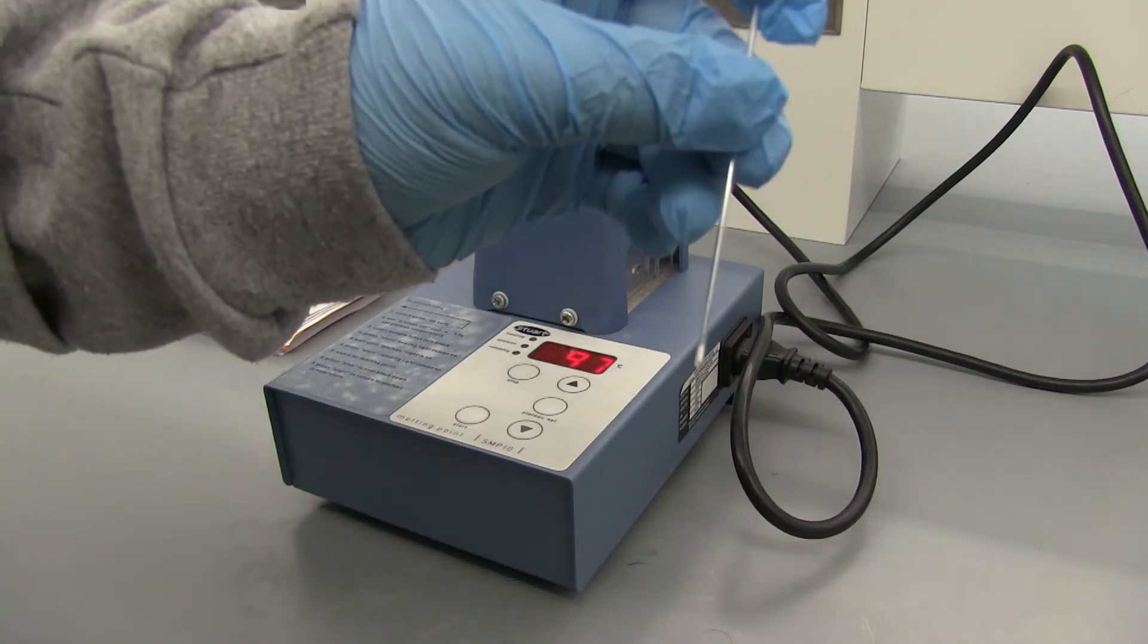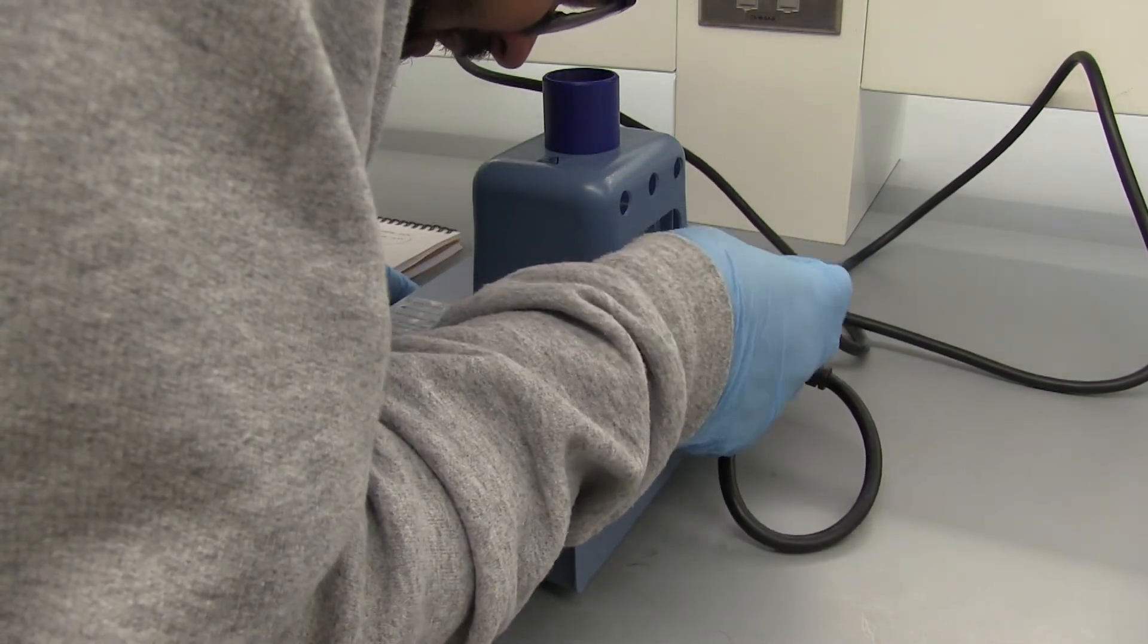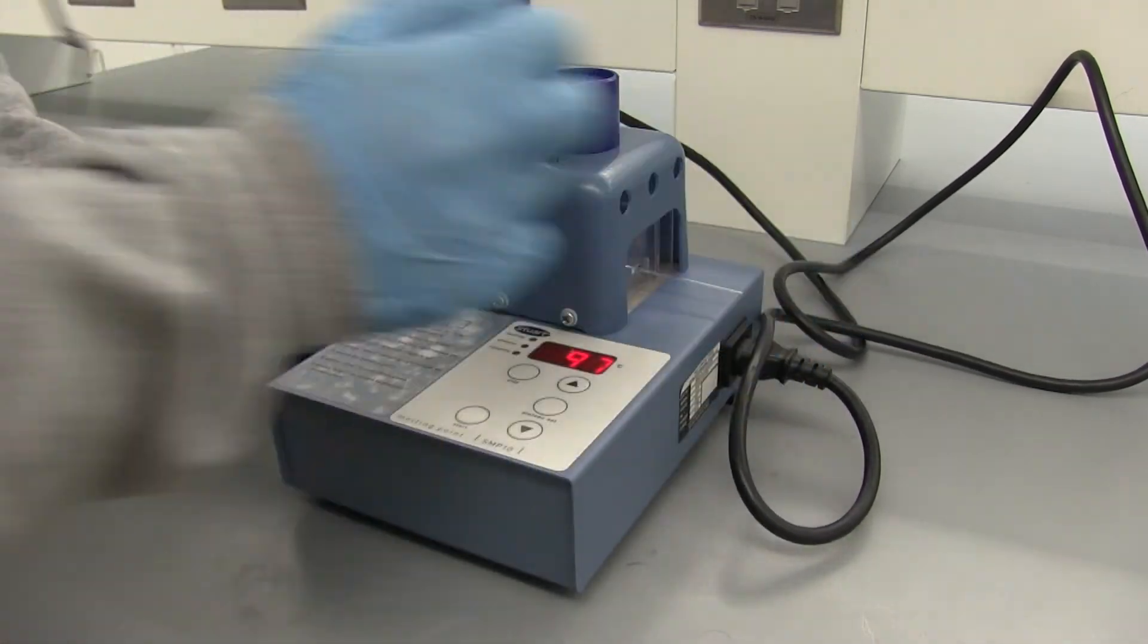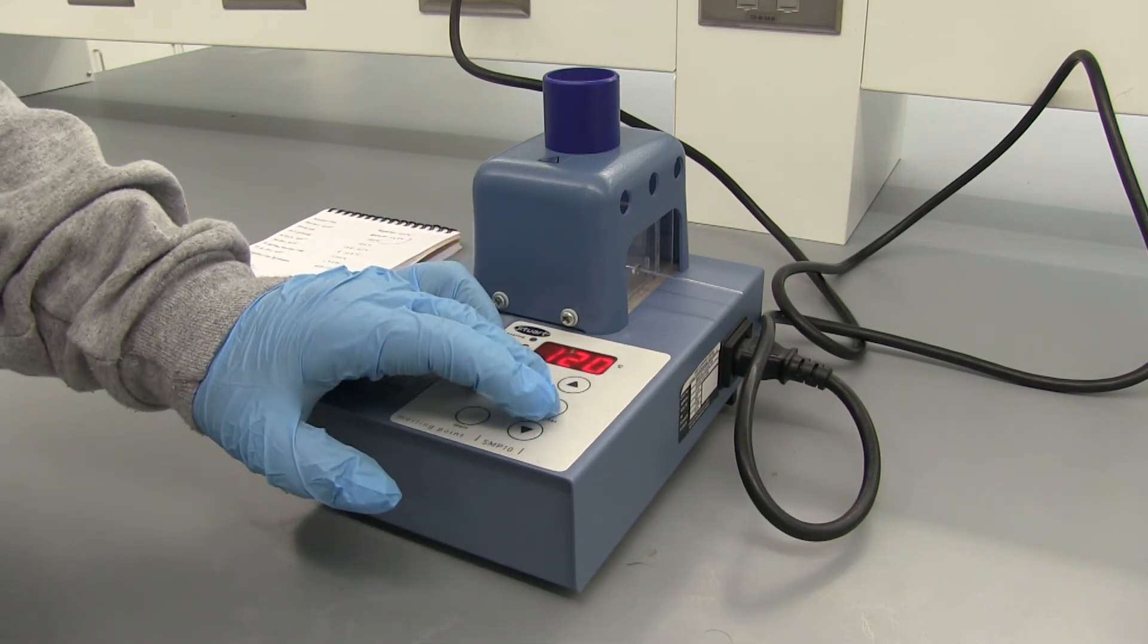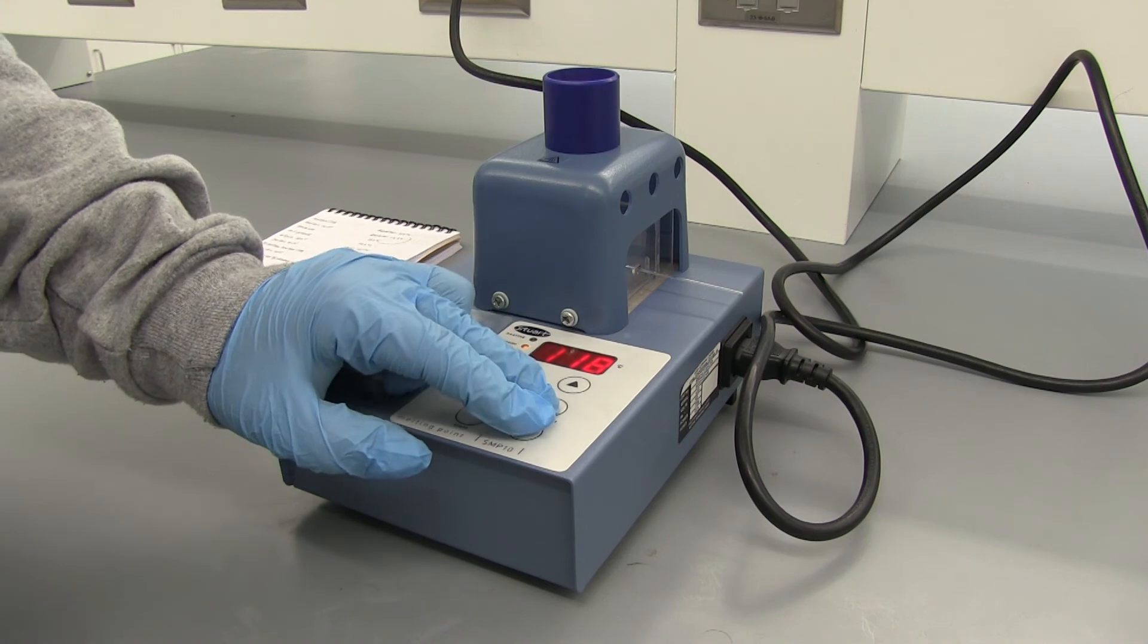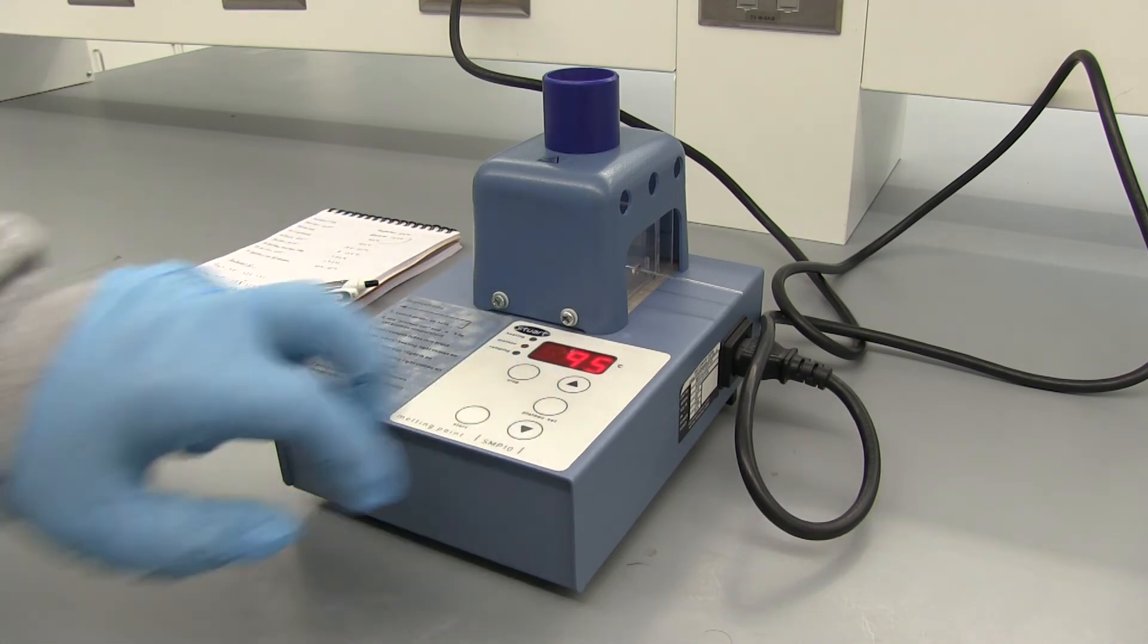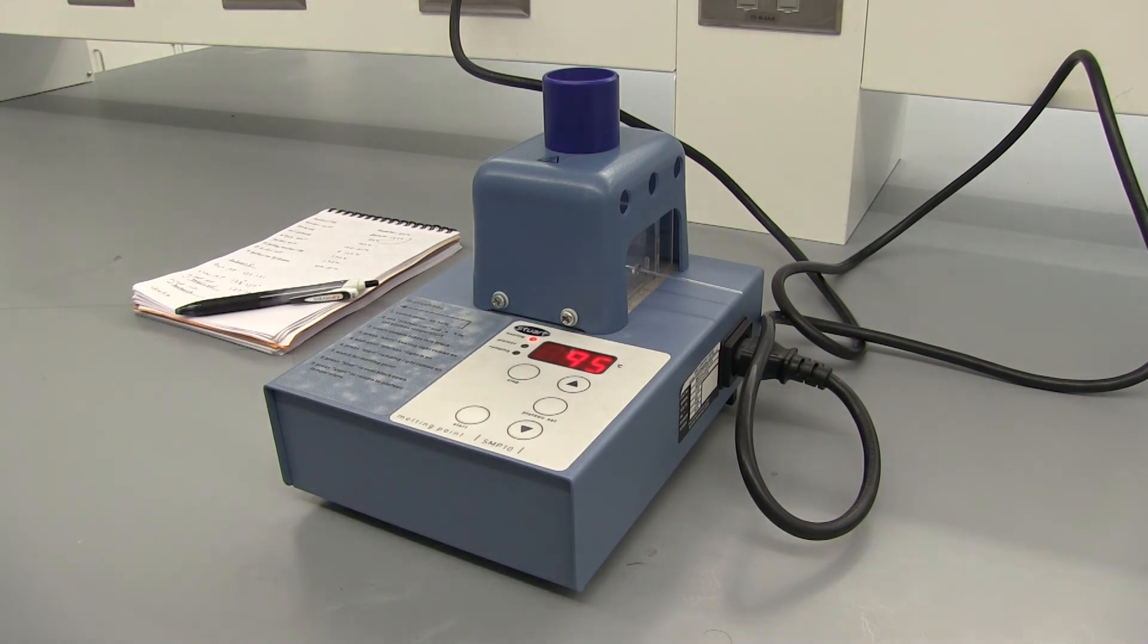Alright so now I have a mixture of benzamide and our unknown and we'll go ahead and load it into the melting point apparatus. Alright this time since we got a confirmation that it was benzoic acid just to check we're going to run benzamide but I'm going to set the melting point, the plateau, a little bit lower to 118 and we'll go ahead and start it getting heated up. So we expect the melting point to be lower as well as the range to be broadened.